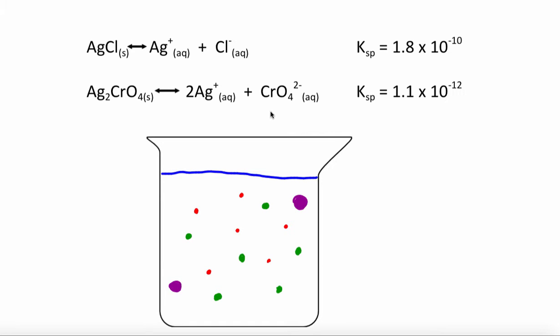We relied upon two different reactions to be able to determine the chloride content of the salt-containing potato chips. The primary reaction that we relied upon was this reaction right here, where we see silver chloride precipitating out of solution when we add silver ions. So effectively, we're taking this equation and pushing it to the left through the addition of silver ions, which we added through silver nitrate. And you'll notice the Ksp for this process is very small.